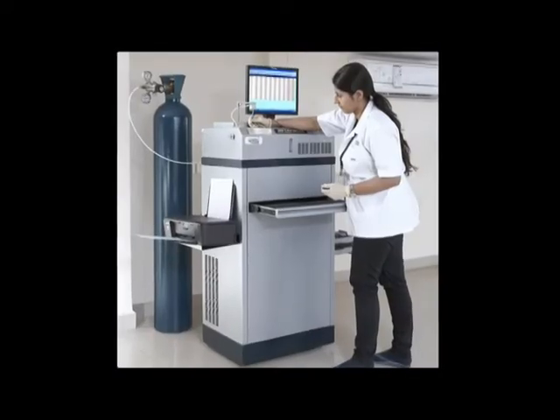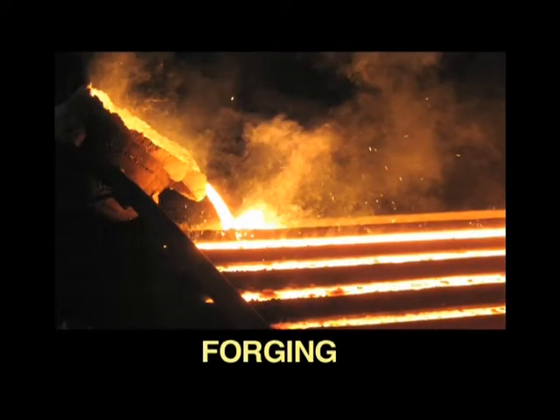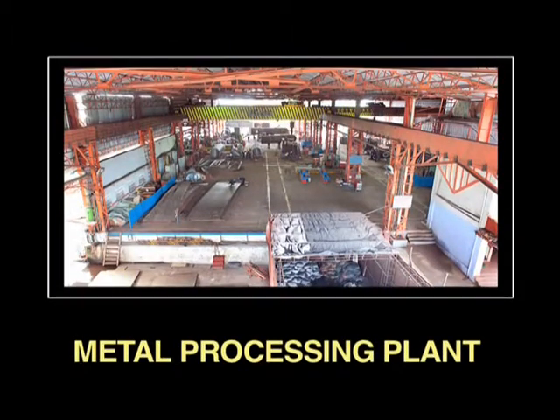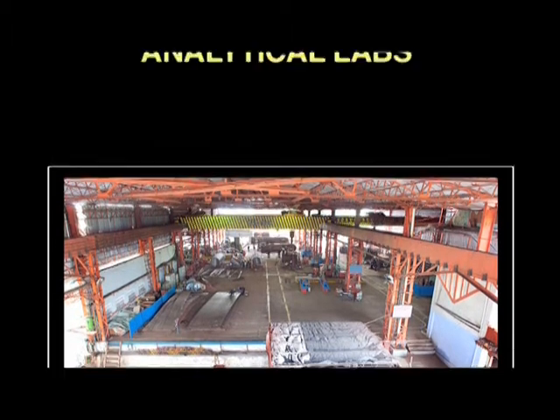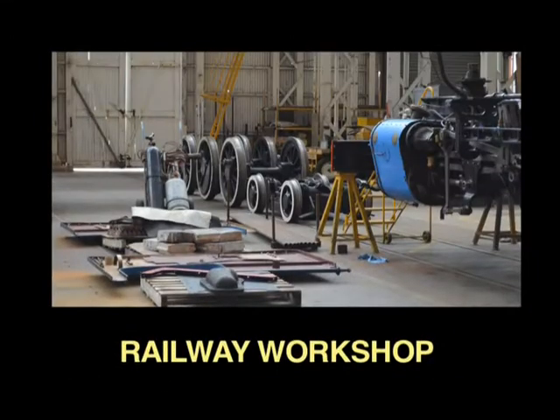It finds application in many industries such as foundries, forging units, automobile ancillaries, steel and other metal making and processing plants, analytical labs, research institutes, and railway workshops.